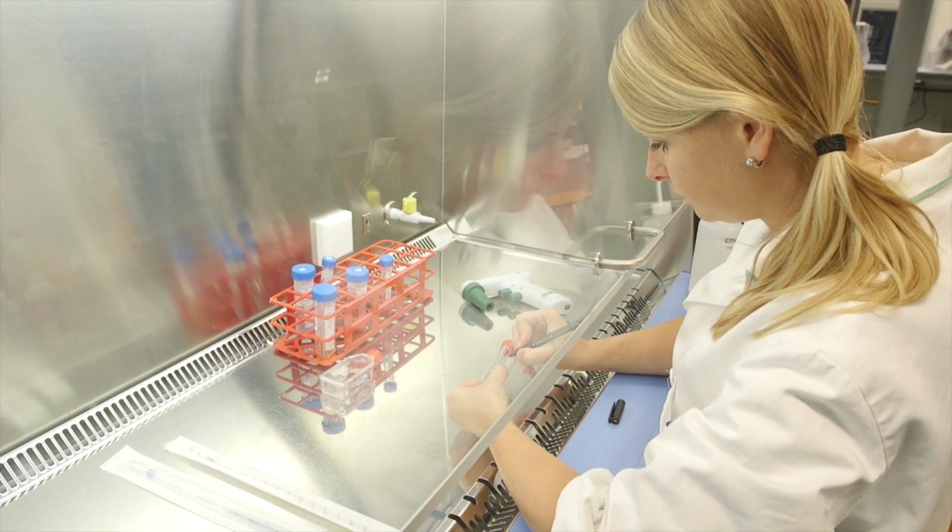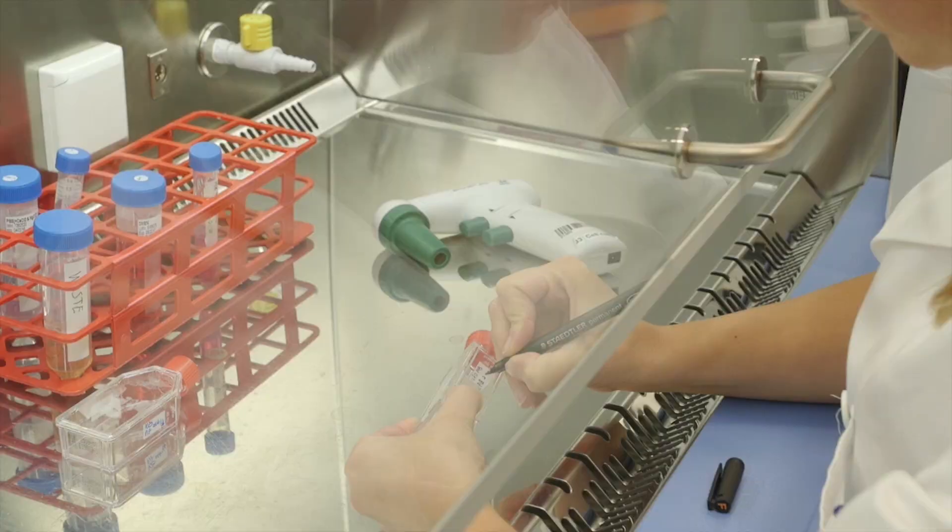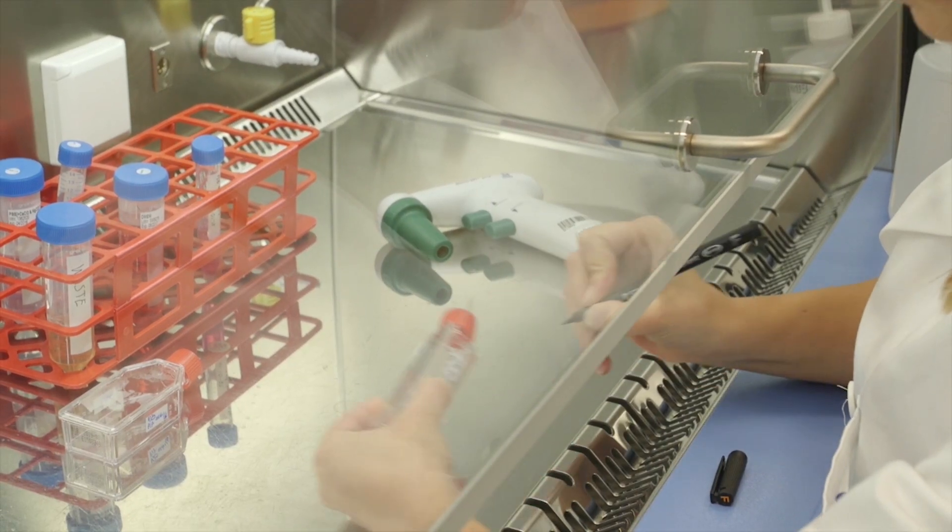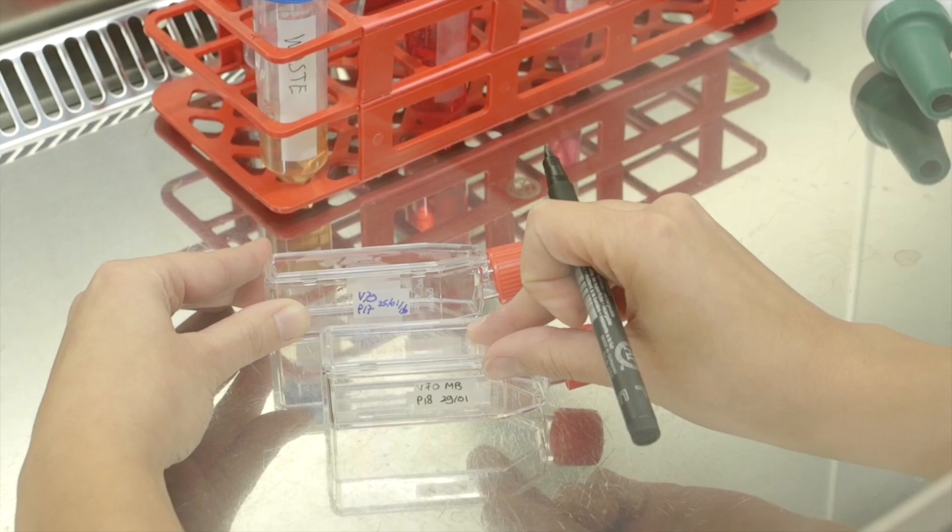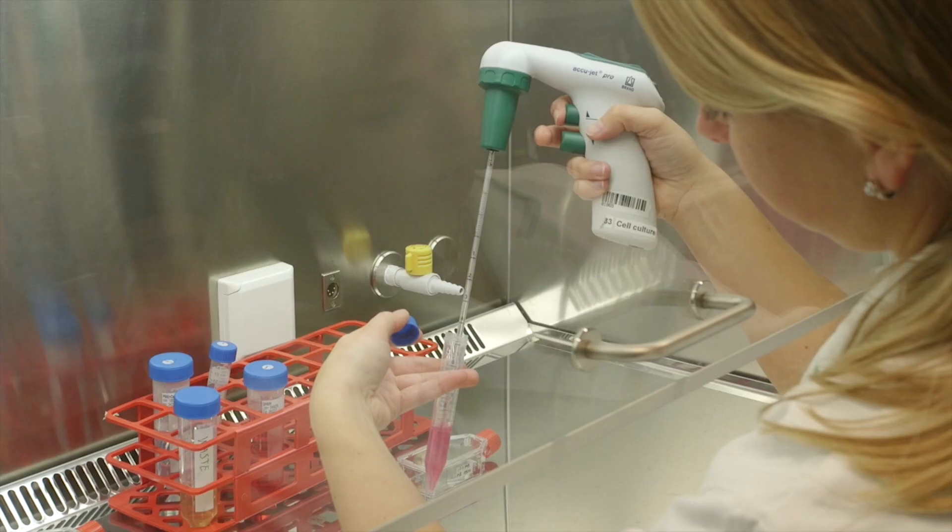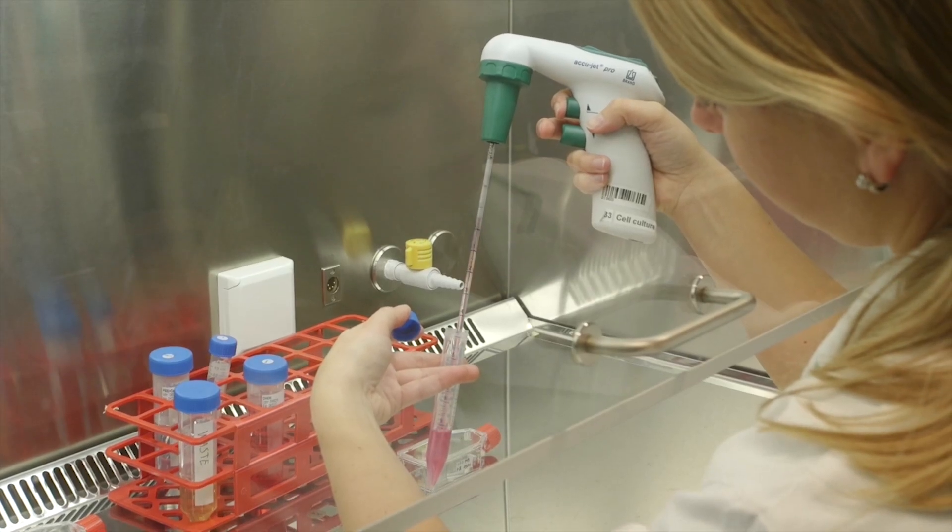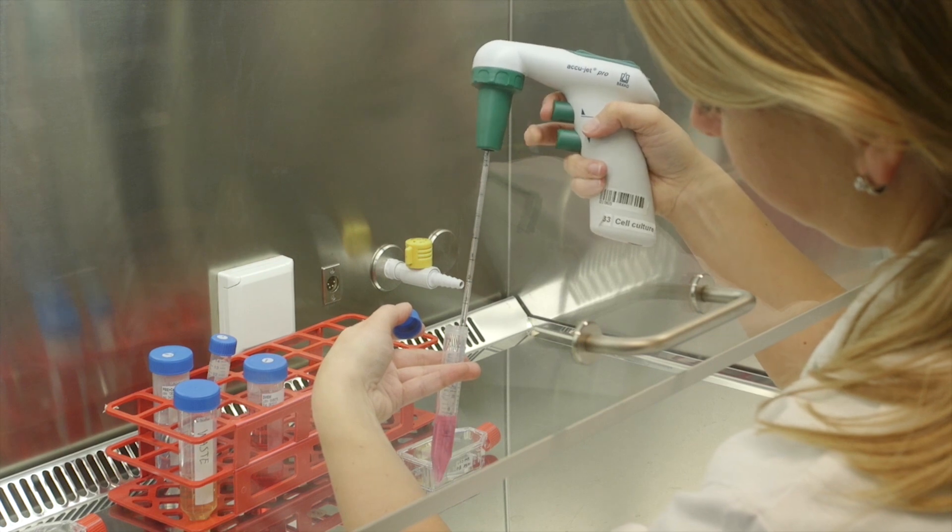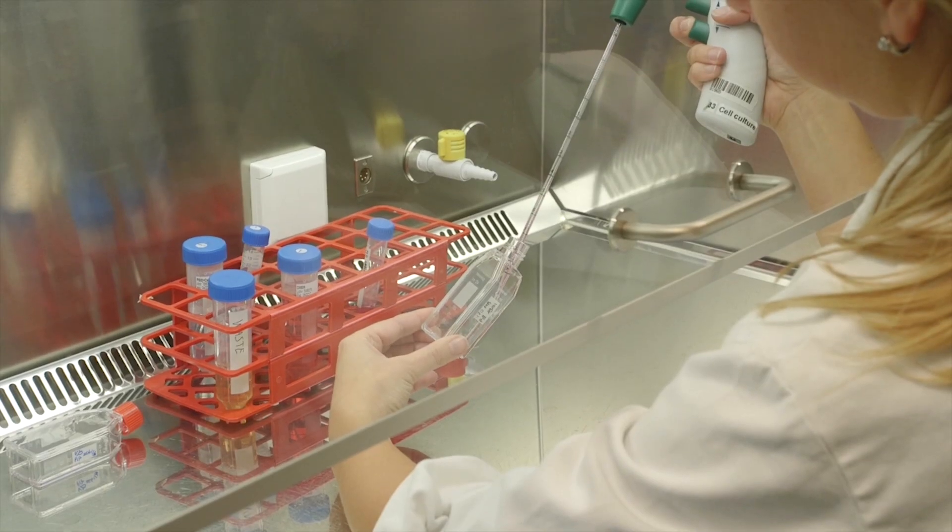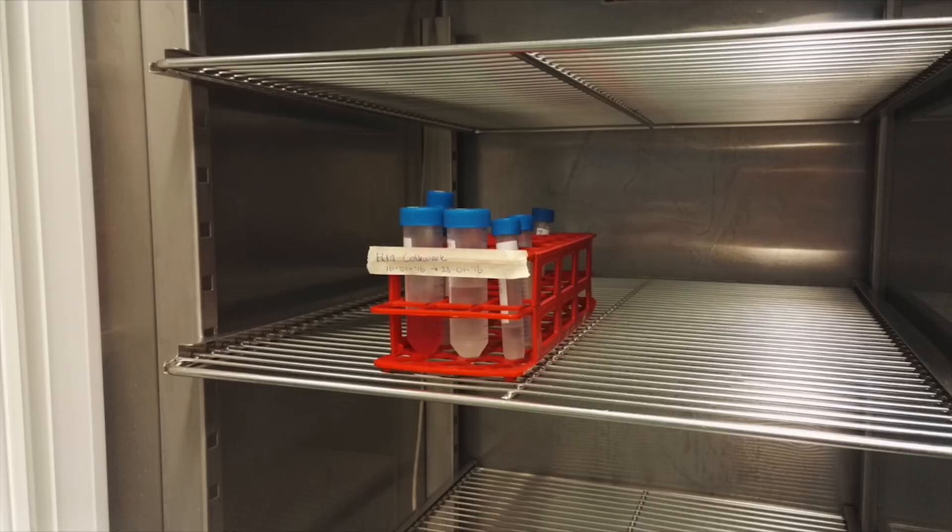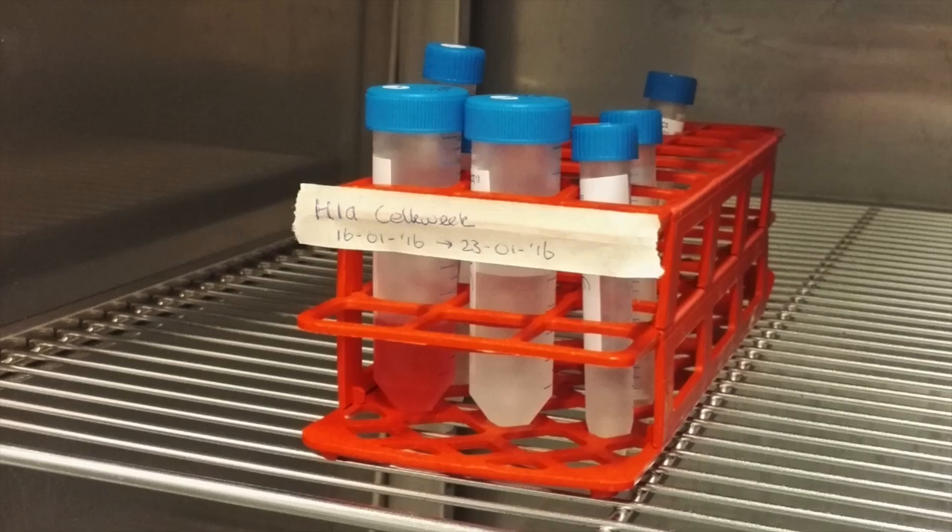Once you have calculated how the cells should be subcultured, you can label a new flask with the identifying information, including the passage number increased by 1. Resuspend your cell suspension and transfer the required amount into a new culture flask. Add the required amount of medium. Make sure all tubes with media and PBS are well labelled and put them in a labelled rack per class in the refrigerator.